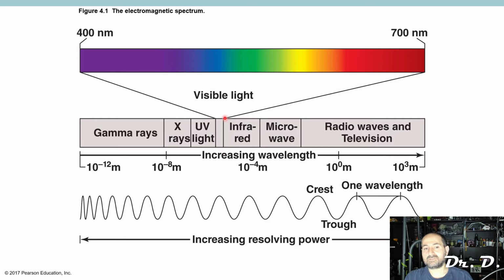Okay, but an electron microscope uses electrons to resolve the image, and electrons are far smaller than the wavelength of visible light, and that's why you can get more magnification with better resolution. Does that make sense? Hopefully it'll make sense later. Then you have infrared. Infrared is longer wavelength than visible light. Microwaves are an even longer wavelength, and radio and television waves are meters big in wavelength.